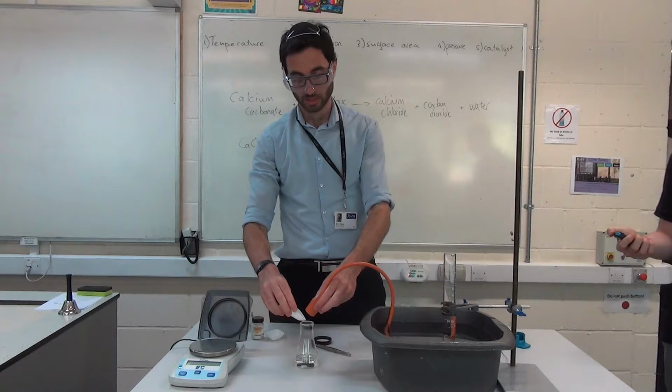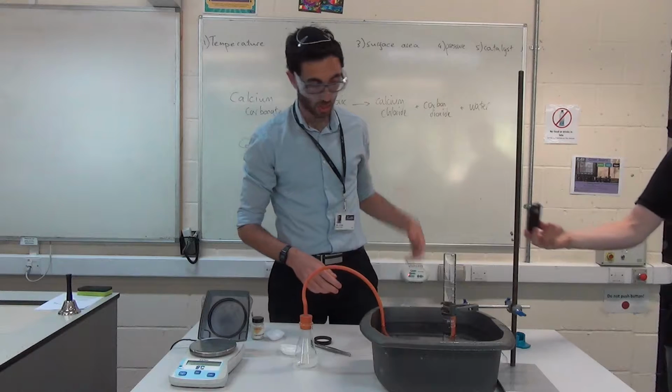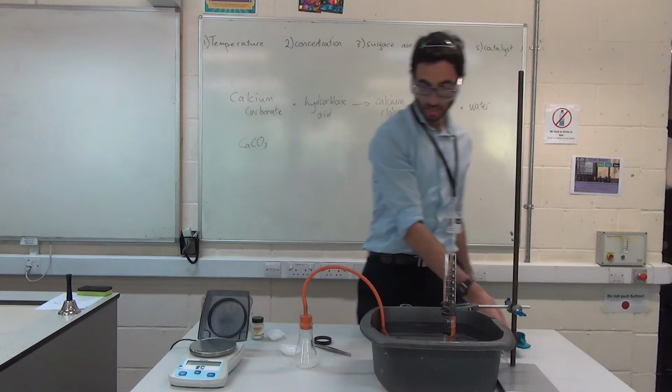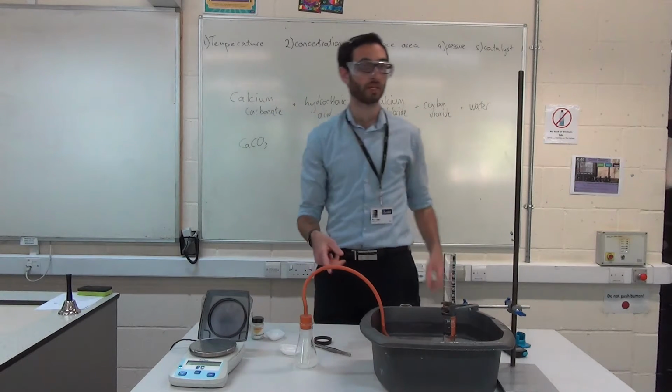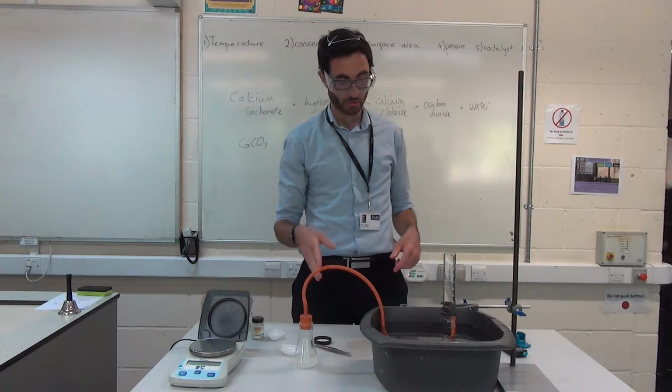Okay, and I'm going to pop that in, put my bung on. Now the reaction is going to get started. Thank you, sir. And I can see that it's fizzing, I can see that it's bubbling. Can I have another of those blue towels, please? I can see that it's fizzing, I can see that it's bubbling, so I know my reaction started.